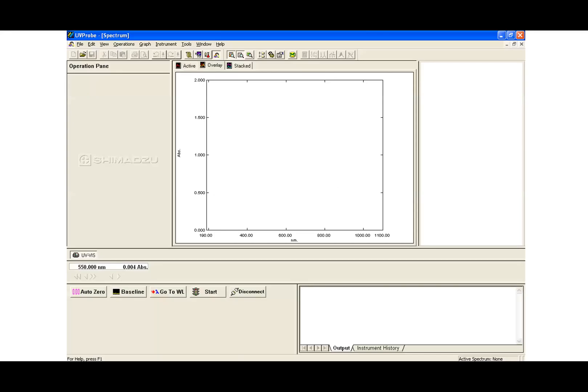For my experiments in particular, I'm interested in doing time scans just to see the release rate of my compound of interest over time, so that's also an option with the Shimadzu 1800. The only difference is that rather than having this single scan button at the top clicked, you would click the one that's pointed with the arrow. That allows you to scan the absorbance over time.